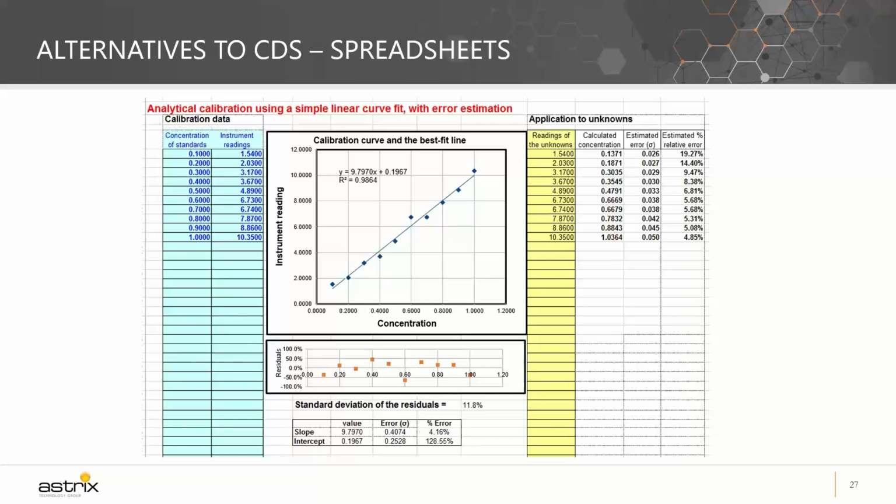So although it might be more comfortable and user-friendly to calculate results on a spreadsheet, because spreadsheets accept basically everything, it is definitely worth the effort to put those calculations within Empower. In addition to providing no access control or audit trails, an Excel spreadsheet doesn't provide those by default. A spreadsheet typically has manual data entries and permits an analyst, for example, to recalculate results before printing and saving the desired result values to the permanent batch record. So people could be cherry picking, putting values here and figuring out if that works for them, if this is a pass or fail. So you don't want that.